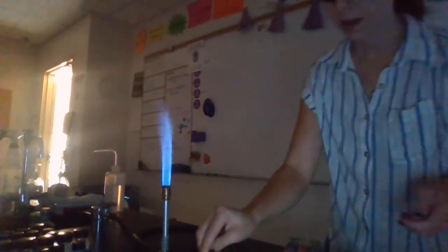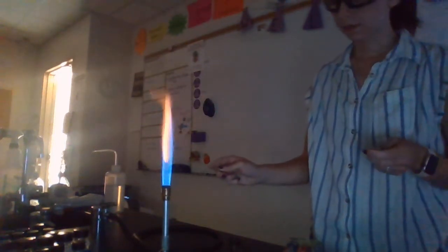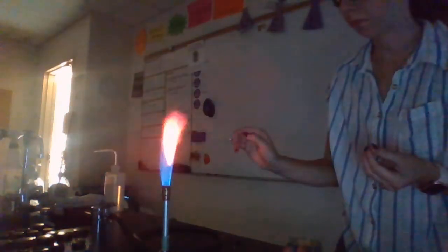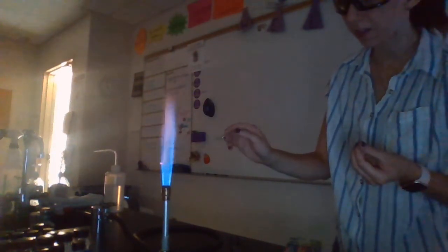Nothing coming off that one. So let's try number 3 one more time. We'll get orange color for number 3. First it had red and then it went to orange. So we'll try out number 3 one more time just to make sure. All right, here's number 3. It's almost like a reddish pink color for number 3, but then goes to orange.